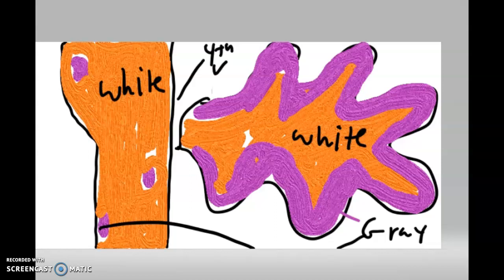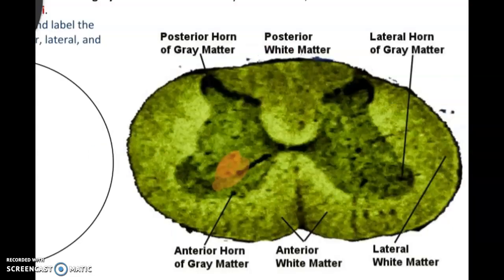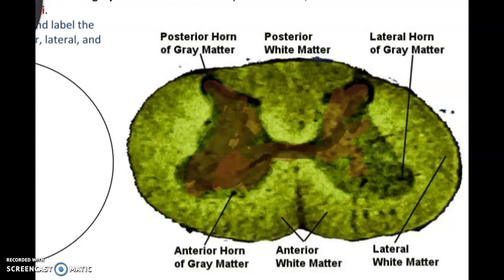And that's the cerebellum. So, like I said, the spinal cord and the brainstem resemble each other in that the gray matter is now deep to the white matter. So you can't really see my shading in. Let's try actual gray. So here's the gray matter, and the gray matter is deep to the white matter around it.